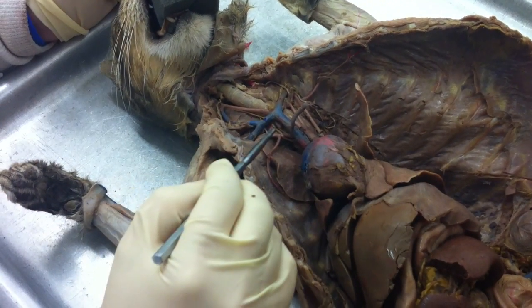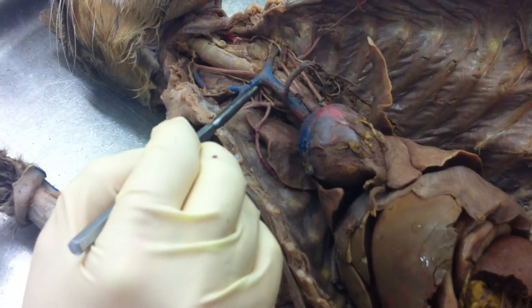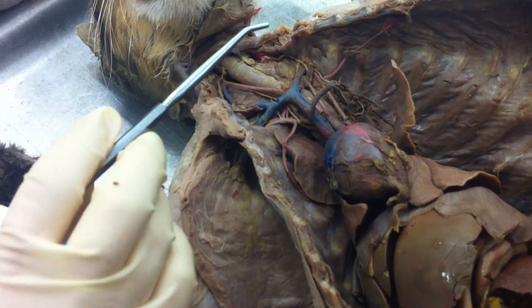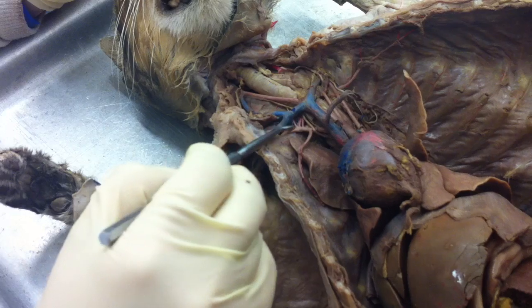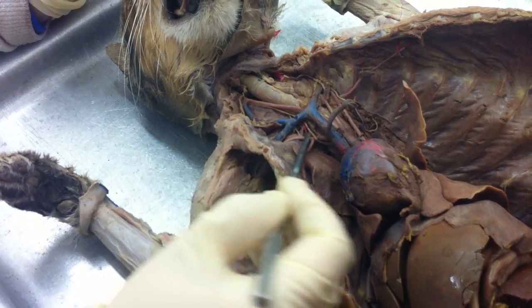The mammary gland. When we get to the end of the subclavian right there, there should only be one going up here, but for some reason this cat has three. Blood vessels are highly varied across individuals. So I'm just going to pick one of these. I'll pick the middle one, and we're going to pretend that that's the only one there.